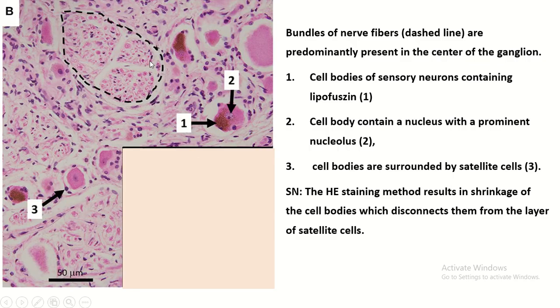This dotted line area is the nerve bundle, and this is the cell body of the sensory neuron. You can see the nucleus with prominent nucleolus, lipofuscin granules, and this is the satellite cell.